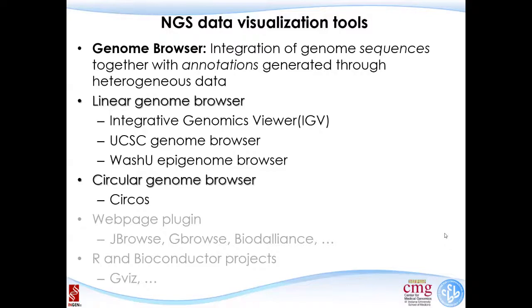So that's a challenge in NGS data visualization. And next, we're going to talk about several tools used a lot in the visualization of NGS data. So that is a genome browser. So first thing, what is a genome browser?